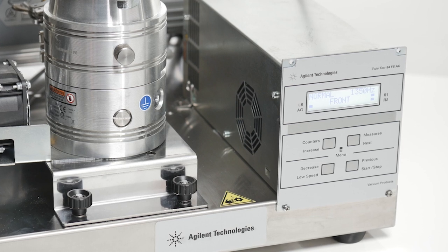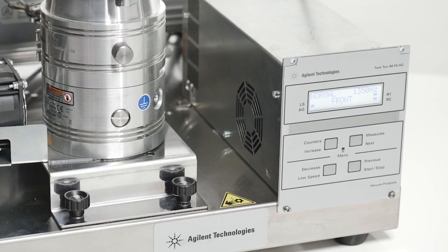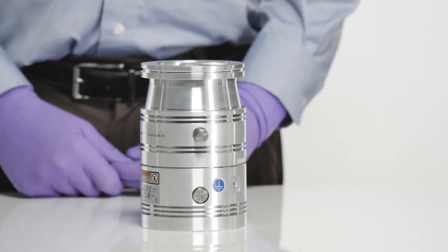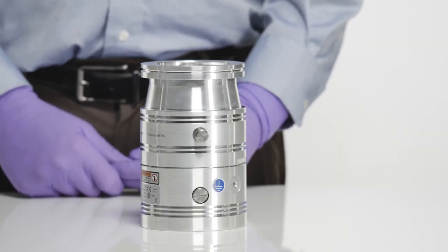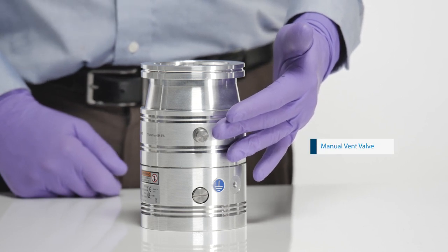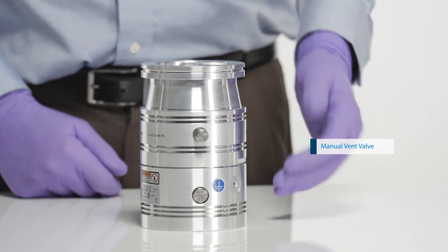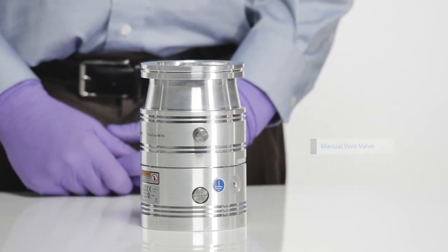The following procedure will show the proper steps to shut down our turbo pump when venting to atmosphere. There are two different options for properly venting the Agilent turbo molecular pump. The manual vent valve is used to gradually introduce room air into the middle of the turbo's rotor stack, slowing the rotor in a controlled manner.